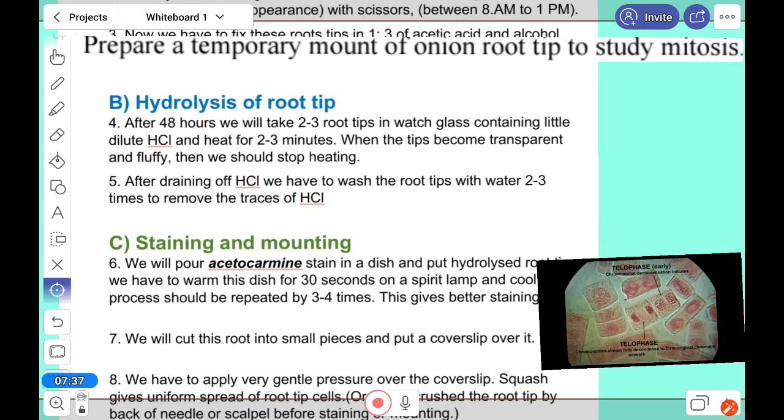Next, we have to hydrolyze. After that 48 hours, we have to take dilute hydrochloric acid and heat it for two to three minutes, and the tip becomes transparent and fluffy.